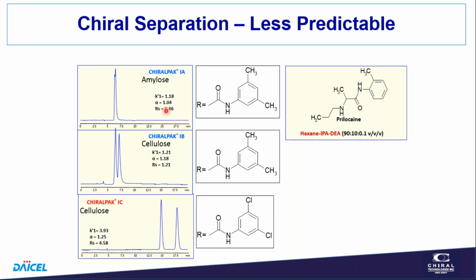This just shows, I won't get into stationary phases, but we have a difference of retention. Chiralpak IA is one of our best columns. We find a lot of separations on IA. In this case, it didn't give very good separation. Chiralpak IB gave a little bit better, and Chiralpak IC gave even better. Well, look at the structure of the molecule, know the structure of the stationary phase. Very difficult to predict that. We have to do that as an experimental process.